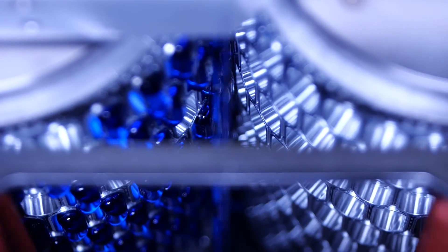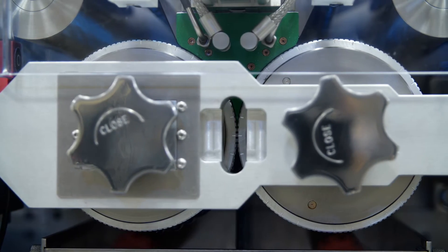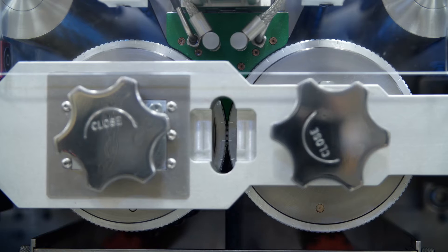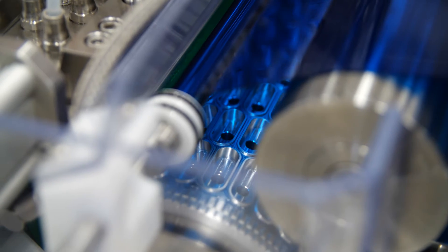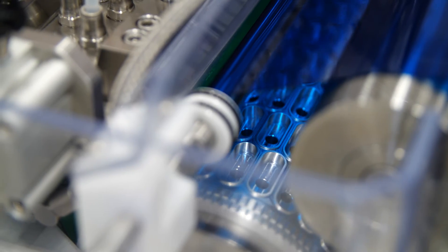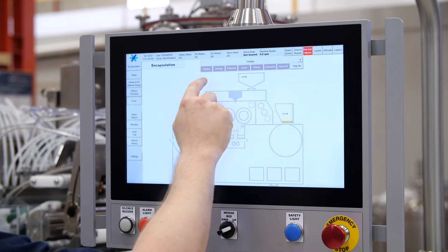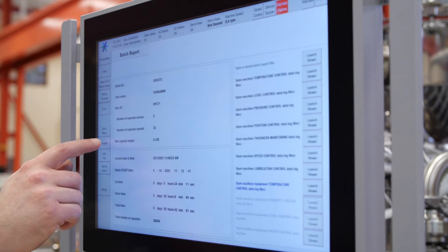There are two important factors to consider during this process. The die rolls need to be perfectly aligned to the same height, and the injection timing must be programmed prior to commencing production. Both of these processes can be completed by a single operator using the PLC screen, without making any mechanical adjustments or using any tools.